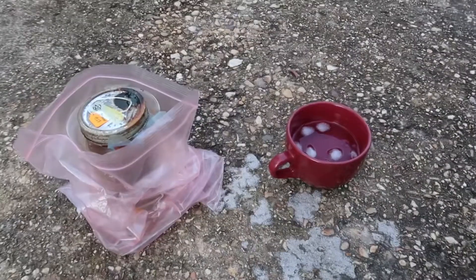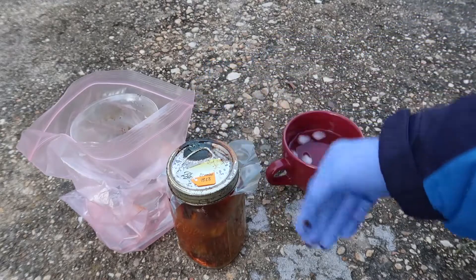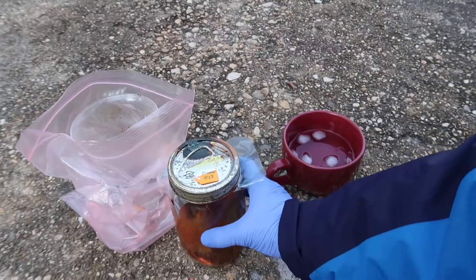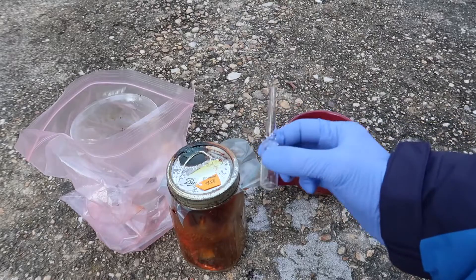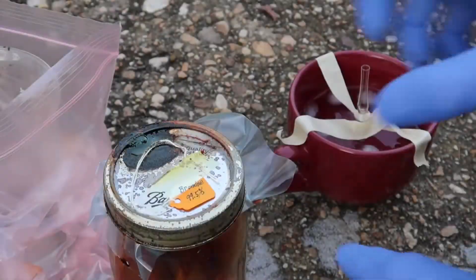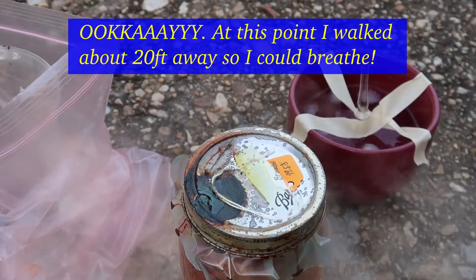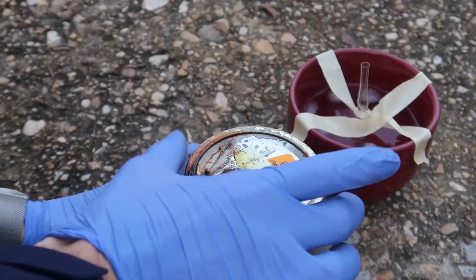We're going to try to ampoule bromine today. Got this very ugly jar - it obviously leaked out, it's already on my fingers. You can see the tag has turned half orange and it's still white where the tape is. We're going to try to ampoule this mess. Got some good ampoules here and we'll try to suspend it in ice water and then melt the top. Got plenty of safety equipment on - you always worry about the glass exploding or cracking.